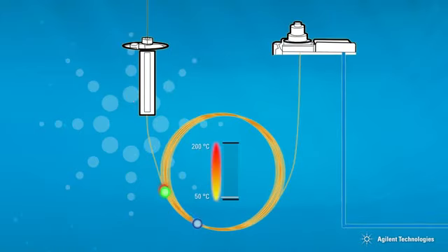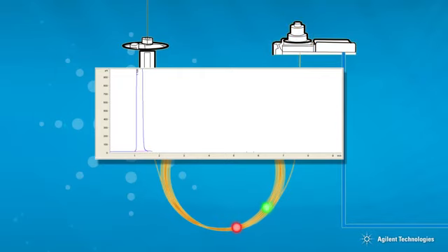The lighter, lower boiling point solvent moves away from the sample components that are being analyzed towards the detector. The first peak in a GC analysis is usually the solvent peak. It will be very large and often saturate the response of the detector.